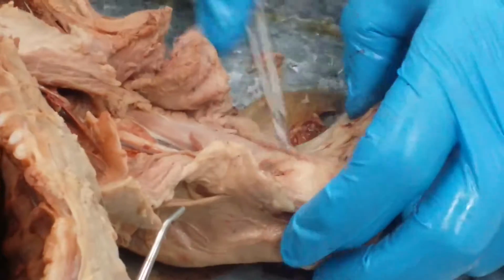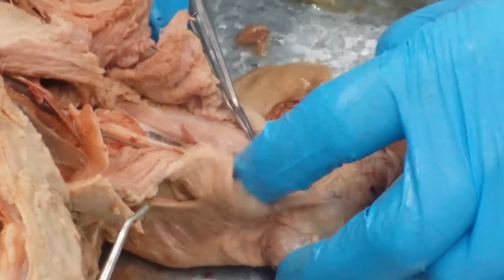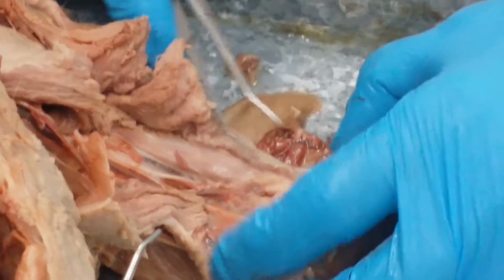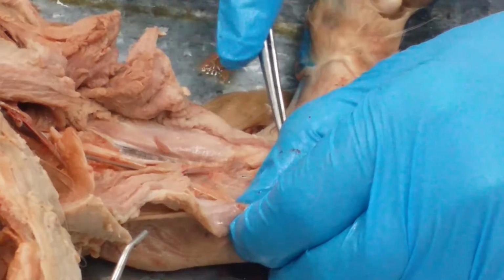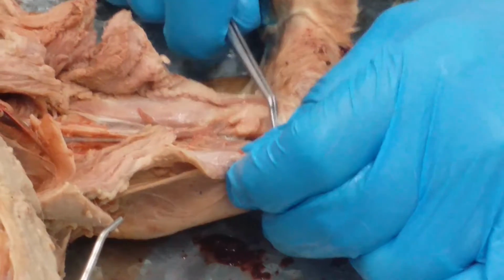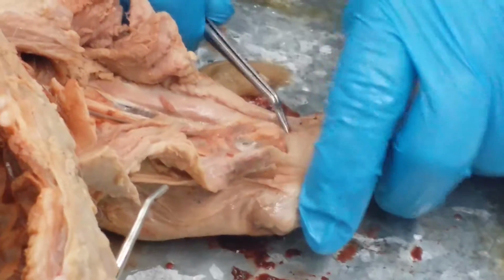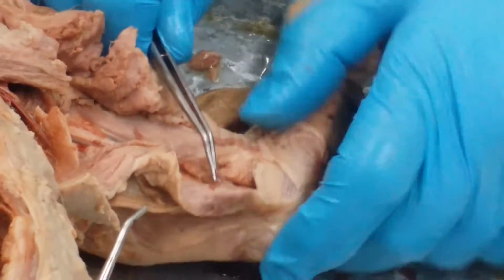The brachial travels down onto the end of the humerus, and there is a branch that runs around the biceps and the brachialis muscle that's called circumflex. Most of them will not be injected. And then it passes down onto the forearm, and in the cat, the vessels are unique as they pass onto the forearm. This is a part of the circumflex here. This is a part of the brachial.